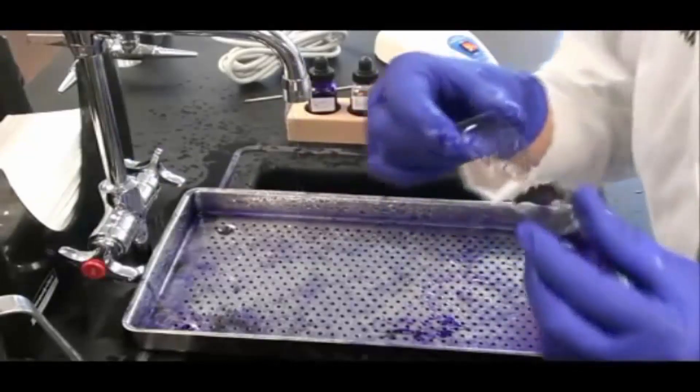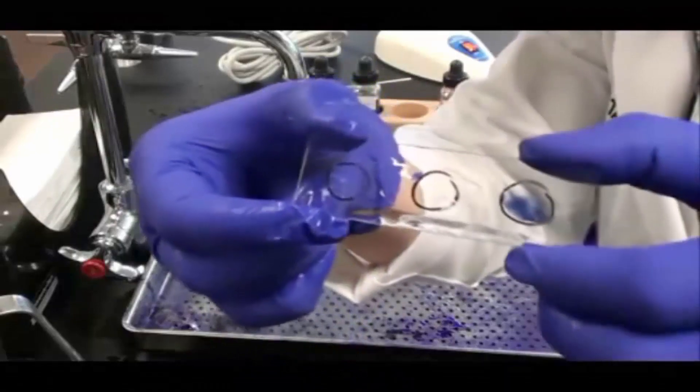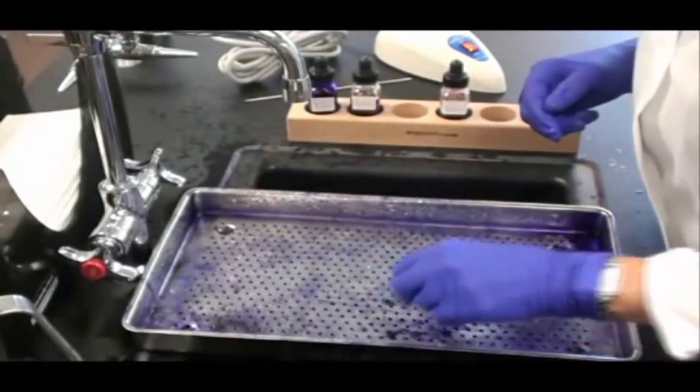Let's take a look at the slide now. I'm holding it upside down, so it is reversed — that puts the Gram-negative control on the left. You can see that the color was removed from that Gram-negative control. It also looks like the color was removed from the unknown.